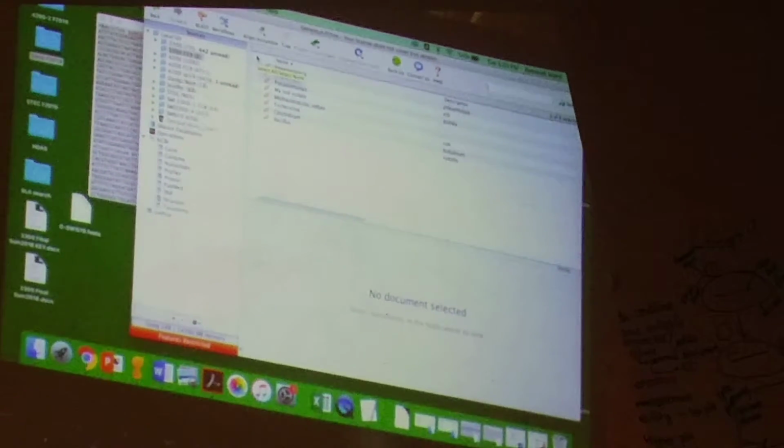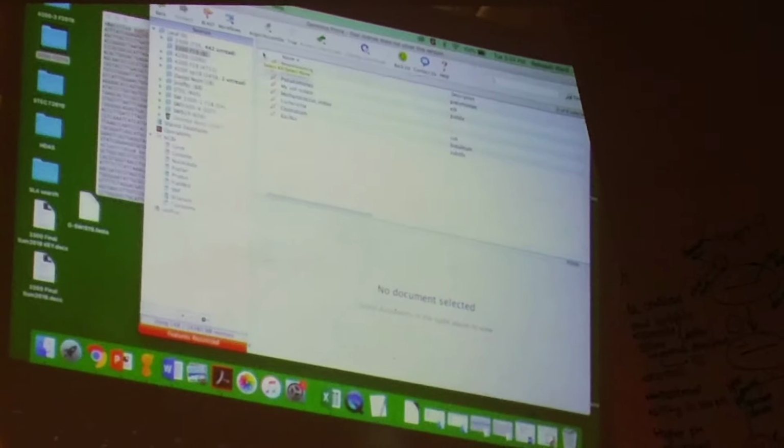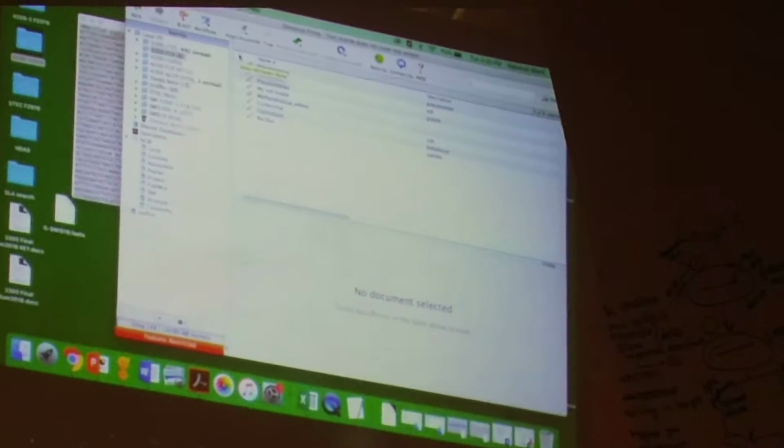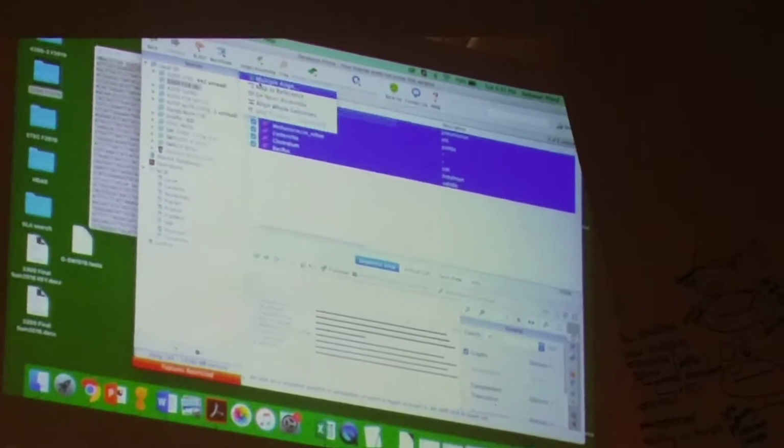Your analysis and making a tree this way would give you probably a B. I'm also going to show you how to make an A tree. So let me show you how to make a B tree, and then I'll show you how to make an A tree. What's the difference? A B tree is crazy, crazy easy. You just select all of these sequences, press Align and Multiple Align. Use the defaults, just press OK.